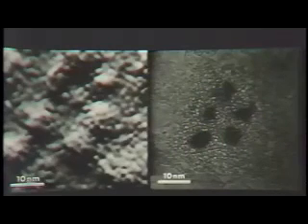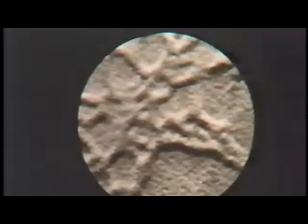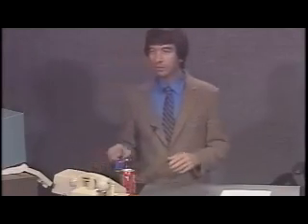Just to show you that things don't always look like balls, here's an example of RecA-coated DNA. RecA is a DNA binding protein. These are filamentous strands of DNA coated with that protein at a resolution that's comparable but not quite as good as what you can get by staining and shadowing in the electron microscope. So that's what we do. That's the kind of pictures that we produce. And the hope ultimately now is to extend at least the biological and organic imaging to a whole new range of materials coated on metal surfaces.